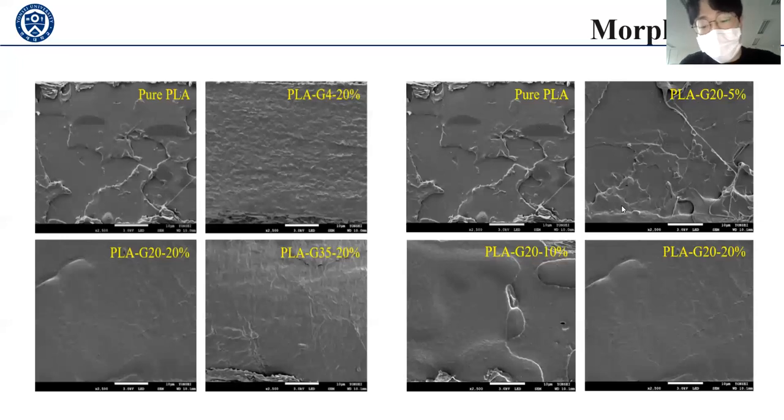The tensile fracture surface was investigated to determine the morphology of the PLA-PEG films by using SEM. As you can see, pure PLA exhibits a smooth surface and plastic deformation in a brittle manner. Whereas in the 20% film with high PEG contents, PEG was prone to homogeneous blending with the PLA because PEG domains could be barely observed. This demonstrates a partial miscibility between PLA and PEGs.